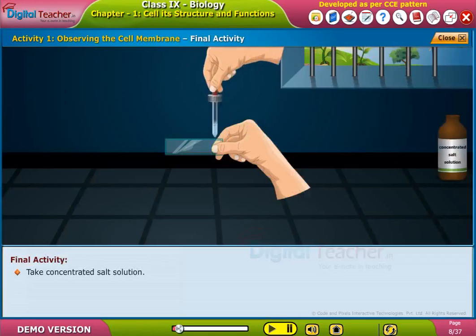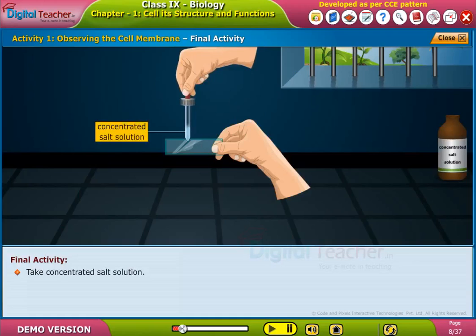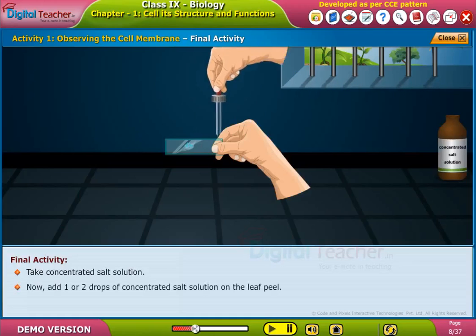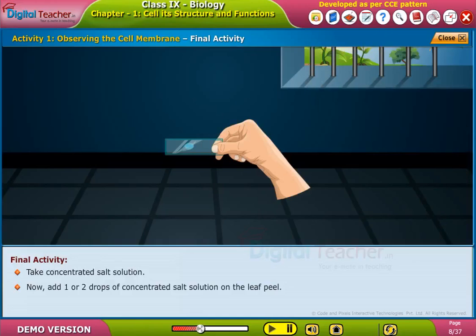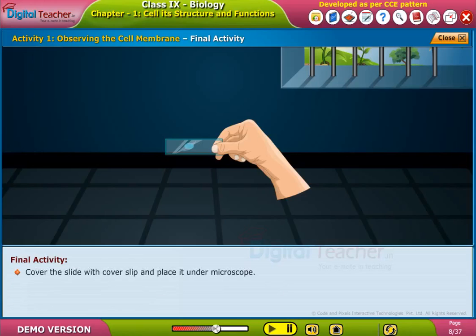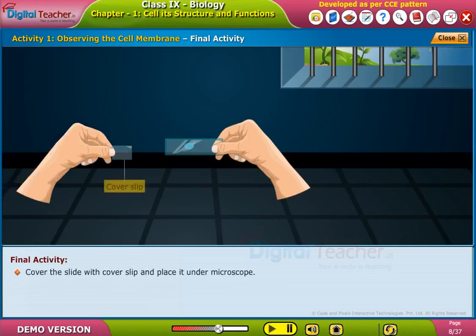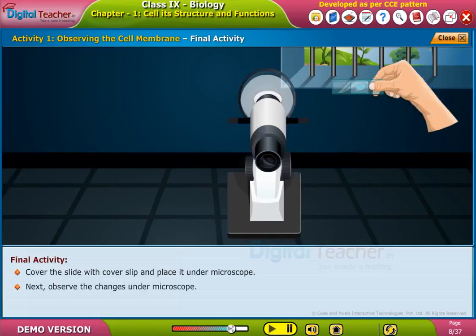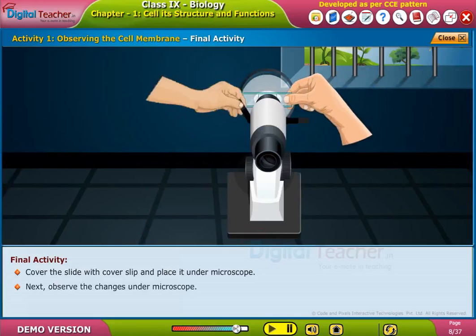Take a concentrated salt solution. Now add one or two drops of concentrated salt solution on the leaf peel. Leave it aside for 5 to 10 minutes. Cover the slide with a cover slip, place it under the microscope, and observe the changes.